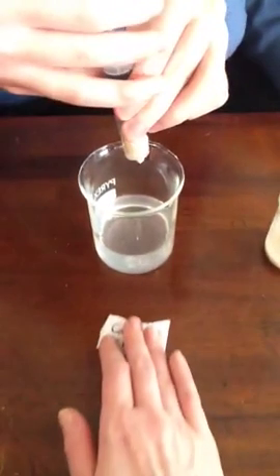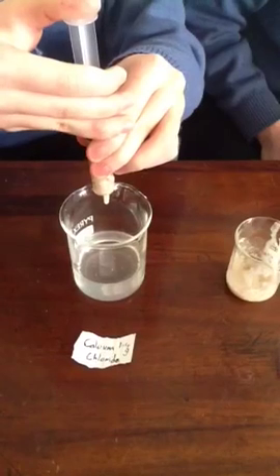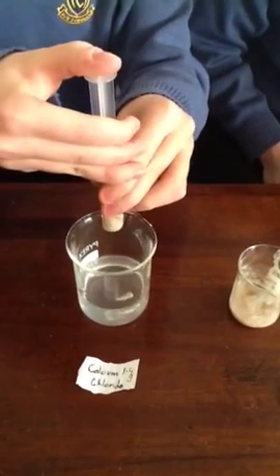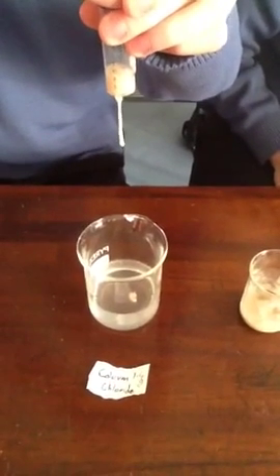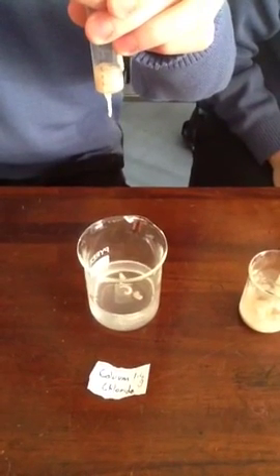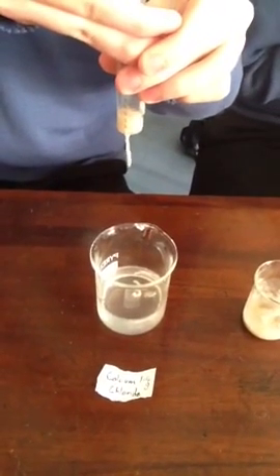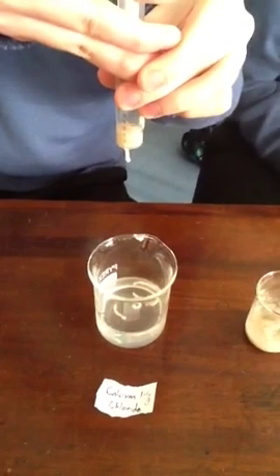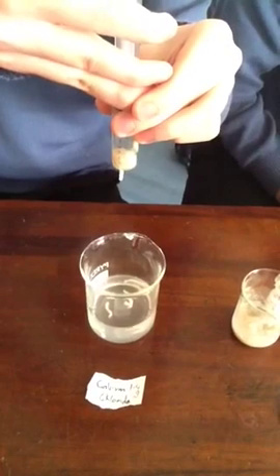We're going to slowly drop it into the calcium chloride. We'll just put the calcium chloride label in front of it. And how do you add it? In small drops — drop-wise. From a height of 10 centimetres or so. Now, how long do we have to leave this? Ten minutes. And we're going to leave it to solidify.